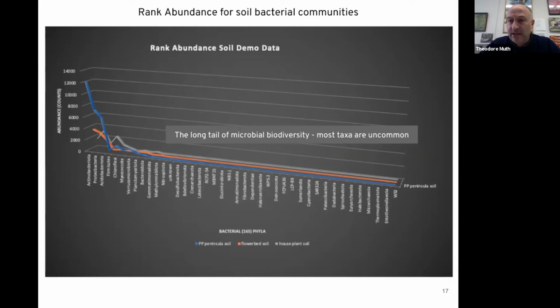There is a negative control sample, and it's just loaded with staph, I think. That's probably because when I was prepping this, as Davida was mentioning, we just ran nothing through one of the columns. So that's our negative control. And probably I inadvertently got some skin stuff in there.